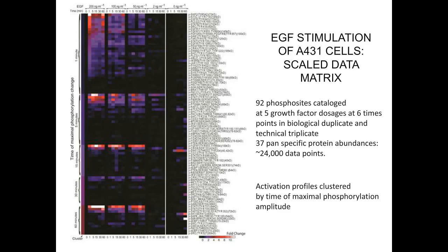Then in the next series at 5 minutes, these are another series of the MAP kinases that are stimulated downstream of the growth factor receptor itself, and that are responsible for initiating cascades associated with cell growth.